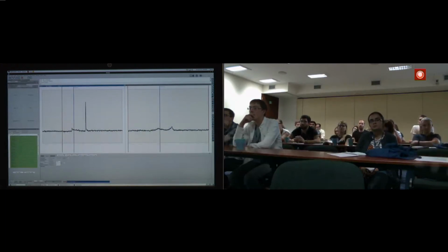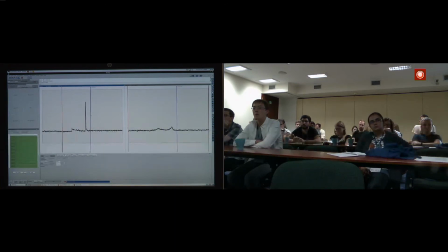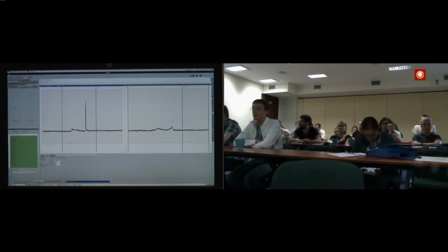Of course, this dipolar decoupling hasn't affected much the carbon signal attributed to the phenyl ring, which is obvious because there are no adjacent protons nearby, right? But at least this particular signal looks much better, and it somehow resembles the liquid-like spectrum. So let me now introduce magic angle spinning.